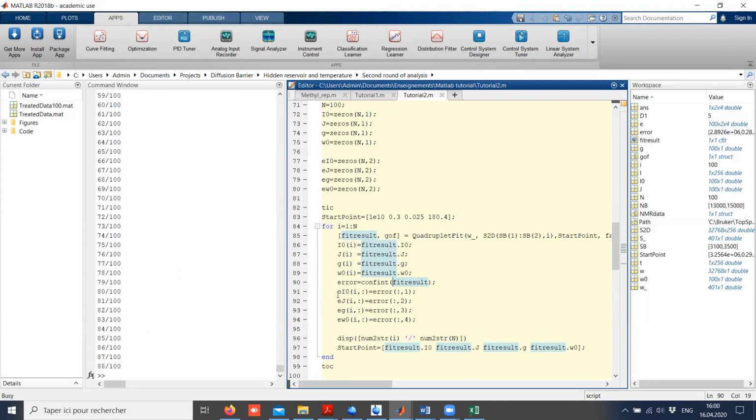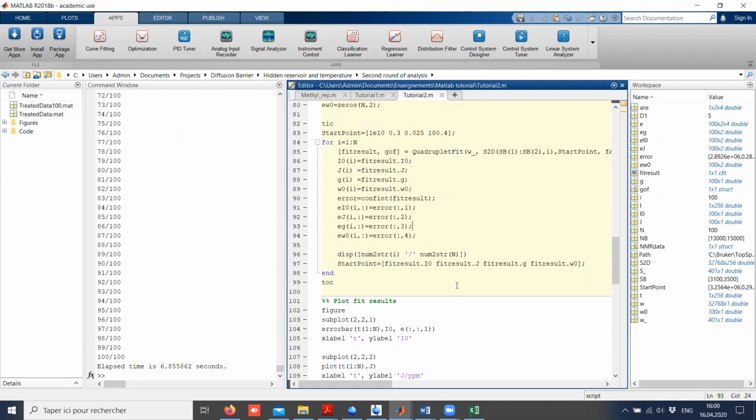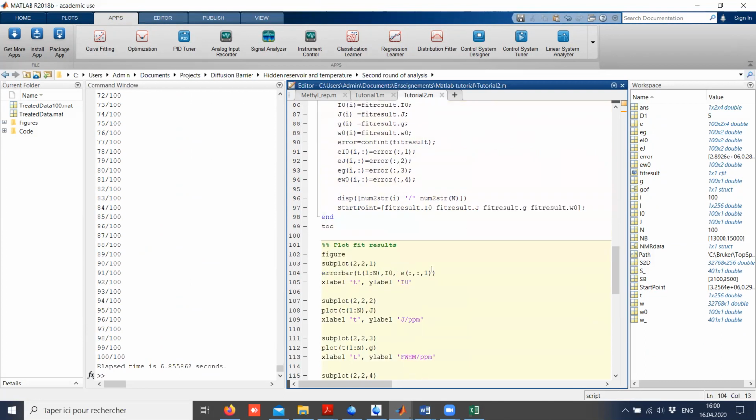So now hopefully, yes? May I suggest that at some point soon we have a break? Yes, we've been going for an hour. Just after this plot here. Perfect. Wonderful. Yeah. Thank you.